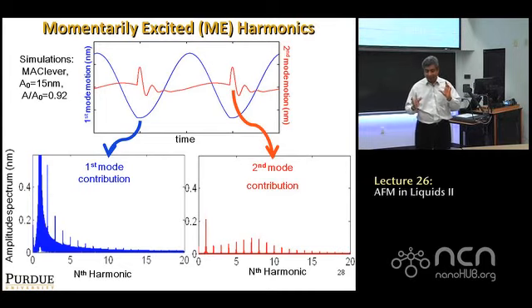So the point I'm trying to make is very fundamental. Let us say the interaction between this ball and the surface is perfectly conservative. No dissipation, right? So let's say there's some short-range interaction force, but there's no dissipation in the contact. So as far as force is concerned, force is a function of distance alone, not a function of velocity. And let's ask the question, if I take this ball in this experiment, is it going to bounce back to the same height or not?